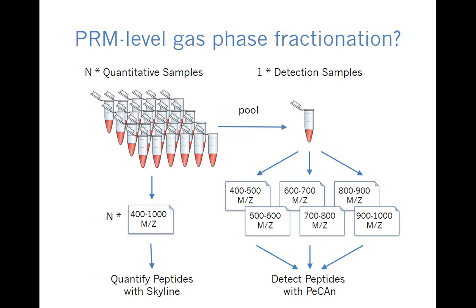And what we're calling these libraries are chromatogram libraries. They have information about the fragmentation patterns that you can see in DIA data. They have information about the specific retention patterns that you detect in these narrow window data sets. So they're much easier to transfer those detections over to the screen. Okay?